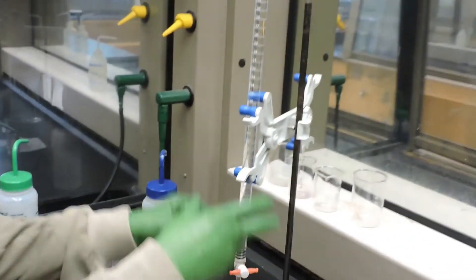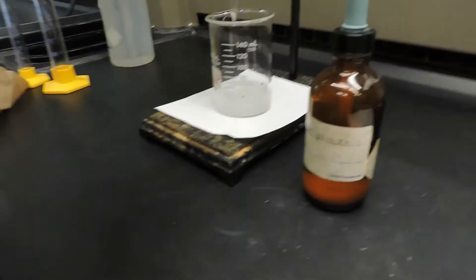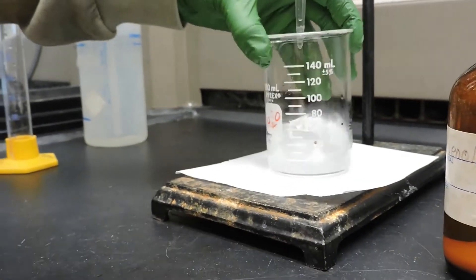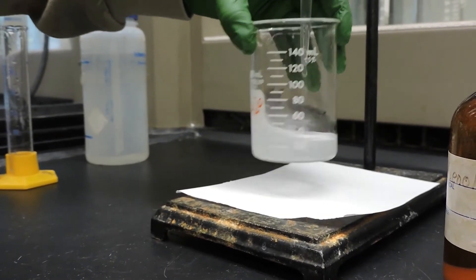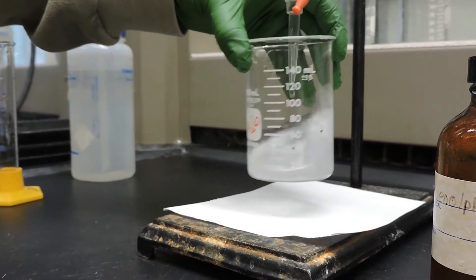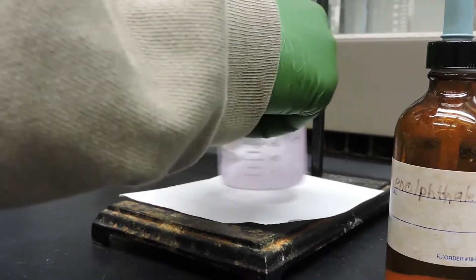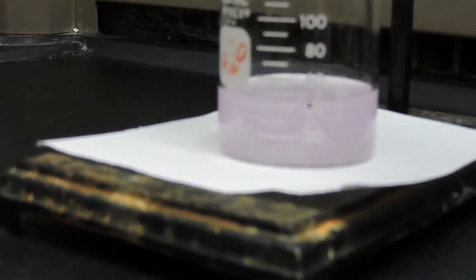This burette is also filled with our standardized solution of sodium hydroxide. The initial volume of this burette is 3.71 milliliters. We'll begin to slowly titrate.